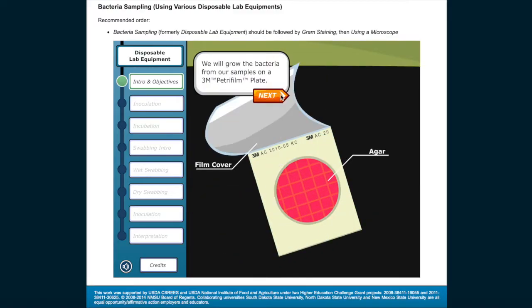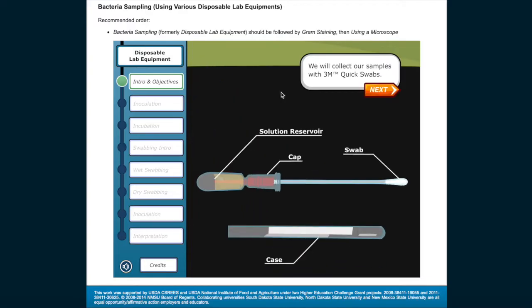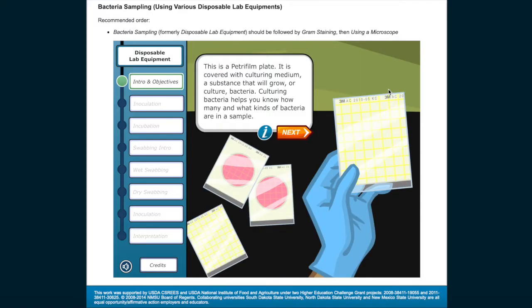We'll grow the bacteria from our samples on a 3M Petri film plate. We'll transfer our samples using a disposable pipette. We'll collect our samples with 3M quick swabs. This is a Petri film plate — it is covered with culturing medium, a substance that will grow or culture bacteria. Culturing bacteria helps you know how many and what kinds of bacteria are in a sample.